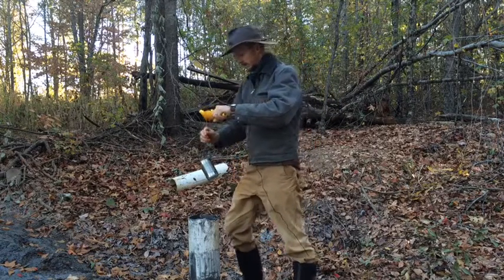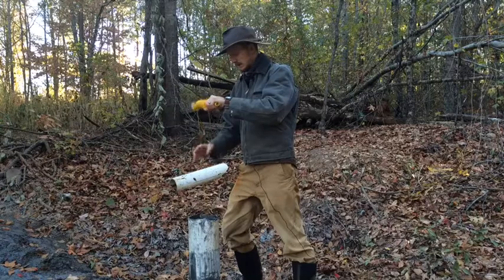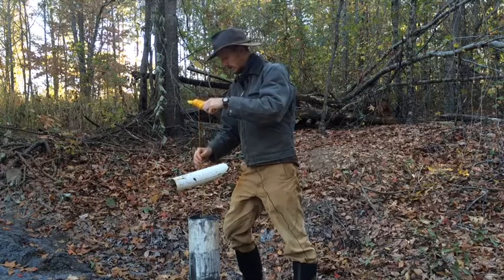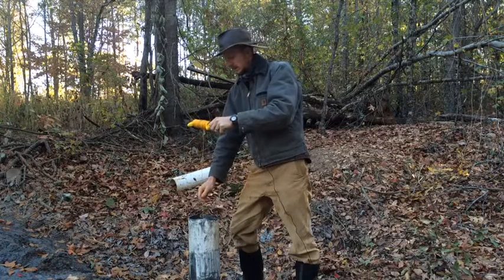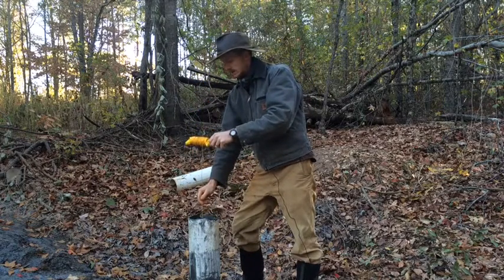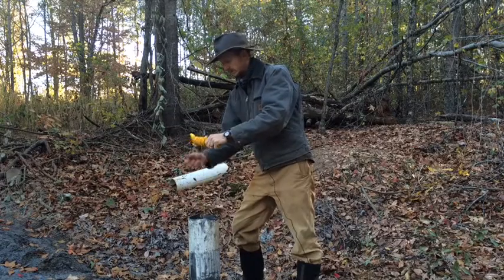So here we go. I'm going to let it down into the well. You can hear it going down. I just heard it hit the water there. So I'm going to pick it up and drop it, and as it fills with more water it gets heavier. And eventually you can feel it — there we go, it's sunk. That means it's completely full.